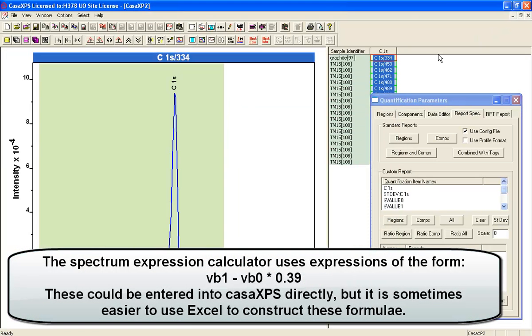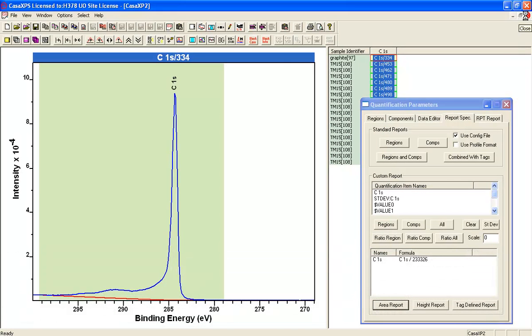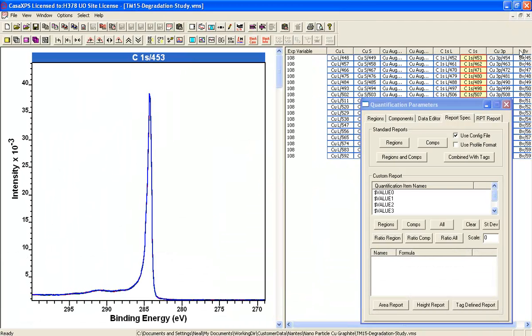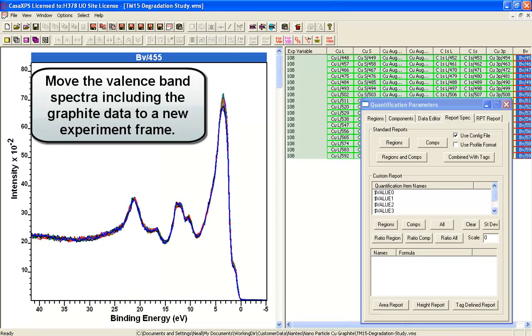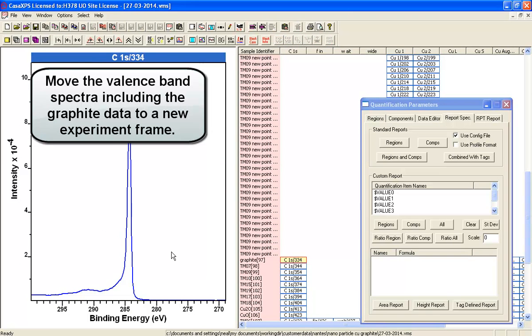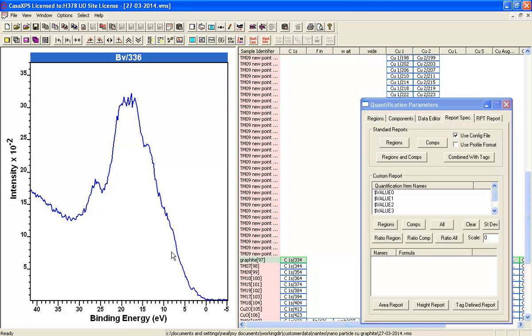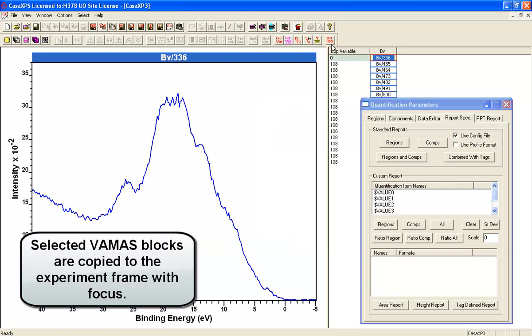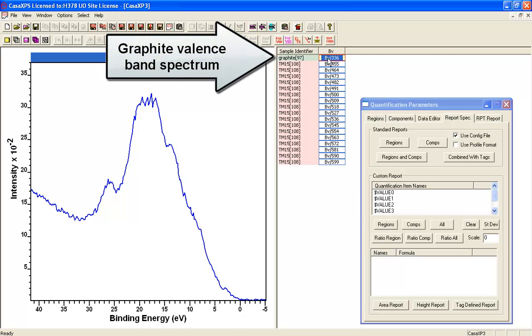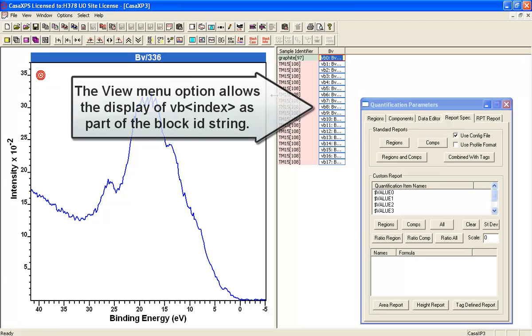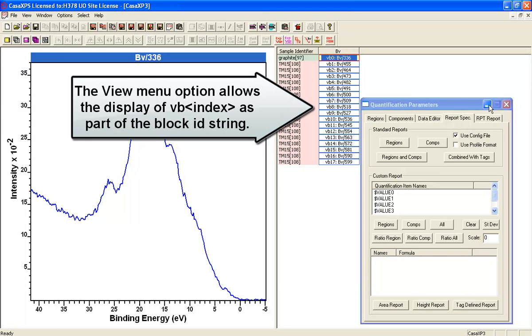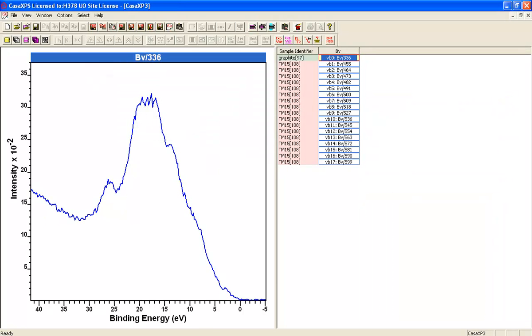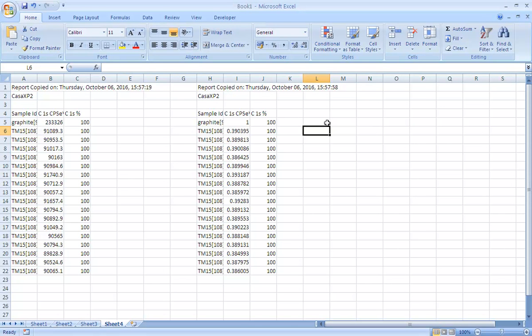Now let's have a look at what we've got here. What we need to do is organize the valence band data so that we can use the calculator effectively. We'll copy it to a new file and we'll also gather the valence band for the graphite. We need to see what the Vb index might be for these data. We'll go to the view menu and enable the display of the Vb indices. We can see the graphite is Vb0 and the copper nanoparticle valence bands will be in Vb1 to Vb17.